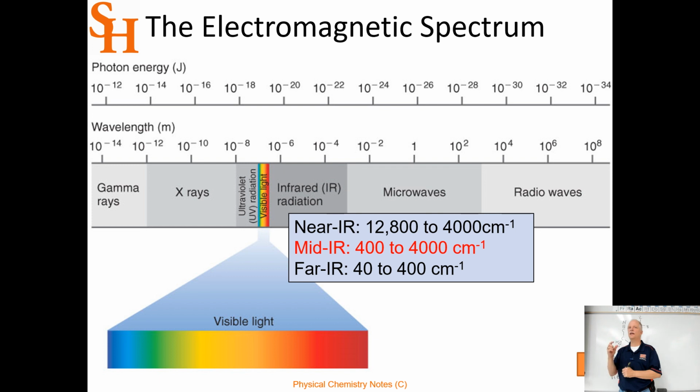And it's not so bad if you're looking at a single beam, but what we're doing is we're taking the ratio, I over I naught. So we're taking a background spectrum and a sample spectrum, taking the ratio. And so when the numbers are really low, some of those numbers are very close to zero, which means you're dividing by zero. And so you get huge jumps in the noise. And so once you get below 600, the spectrum has such tall noise peaks that your signal is really small if you just plot it.